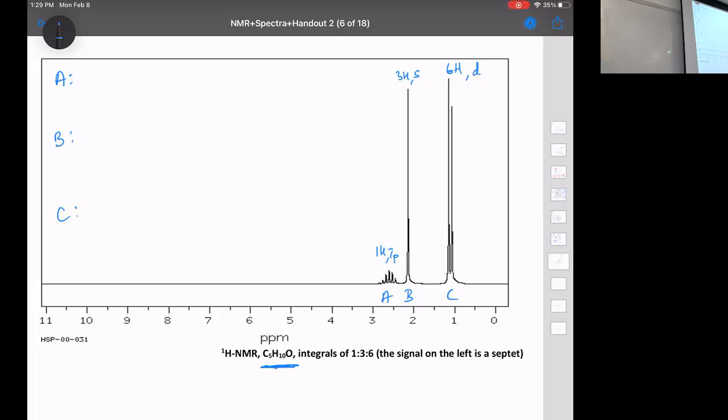The CH3 is definitely over here. You can tell that. So it's going to be some carbon containing functional group, which contains an oxygen and then one other atom. This is C double bond. Because we've got 4 carbons now: 1, 2, 3, 4. That should be 5.